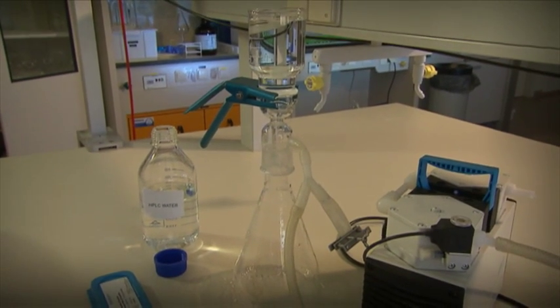Before we get started, remember that Teflon contains PFCs, so don't use it during any of the extraction phases. We recommend that all Teflon tubings and materials in the ultra-pure water system be replaced. HPLC grade water is used in all solutions in water. The blank contamination of solvents and materials used during the analysis must also be tested to prove that they do not contain PFOS or any other PFC of interest. These should be cleaned if necessary and stored covered with aluminium foil. Remember, all steps may be slightly different in your laboratory, so always optimise and validate to suit your own setup.